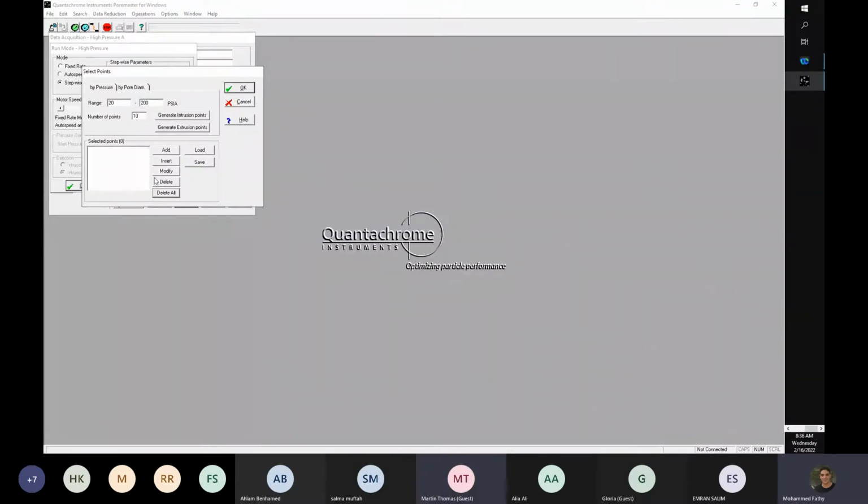Let me just clear that out. I'll create a date. So these are my points up to 200. I say, okay, let's say now I want to go from 200 to 2000, and maybe I want 50 points in that range. Okay, it's going to generate all of those points.